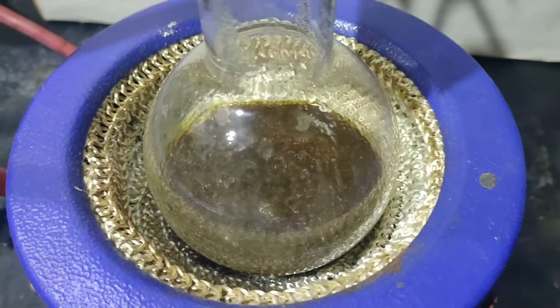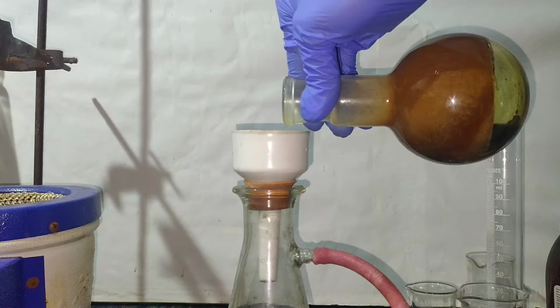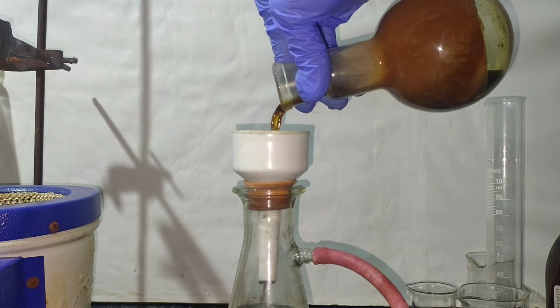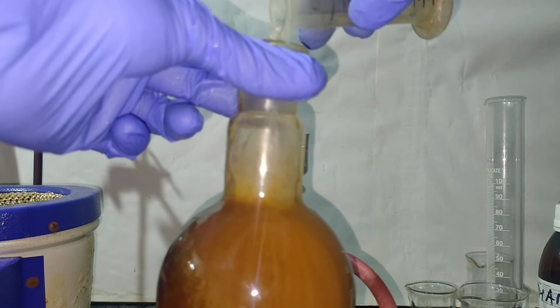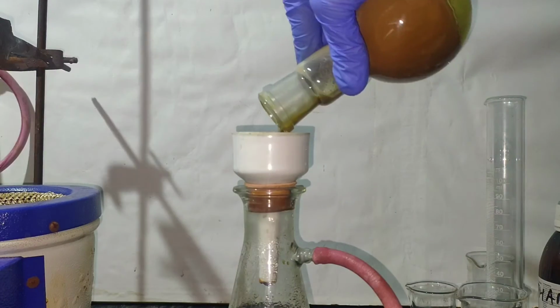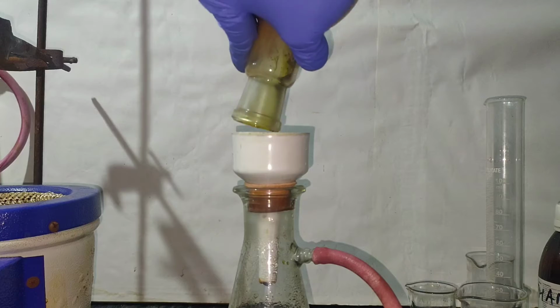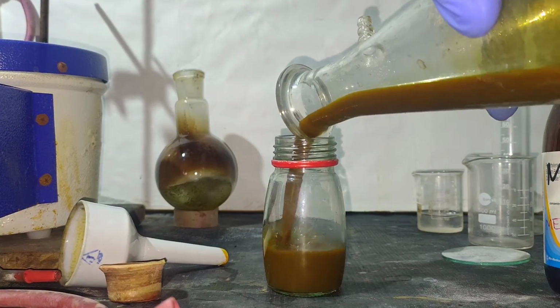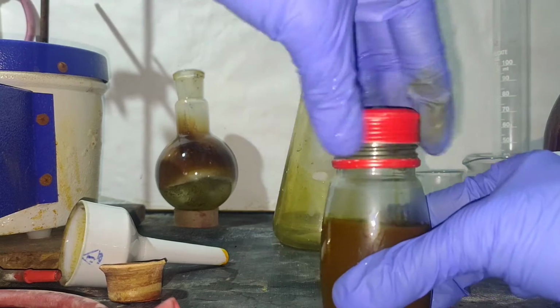After 12 hours, the flask became opaque. I filtered the reaction mixture hot and washed the residue with hot methanol. I transferred the filtrate into a glass bottle with a screw cap and cooled it in the fridge.